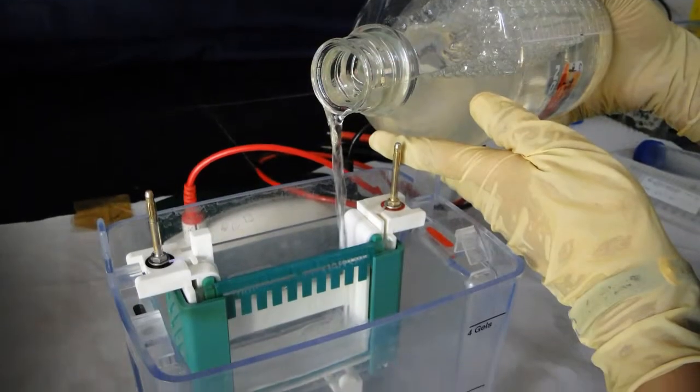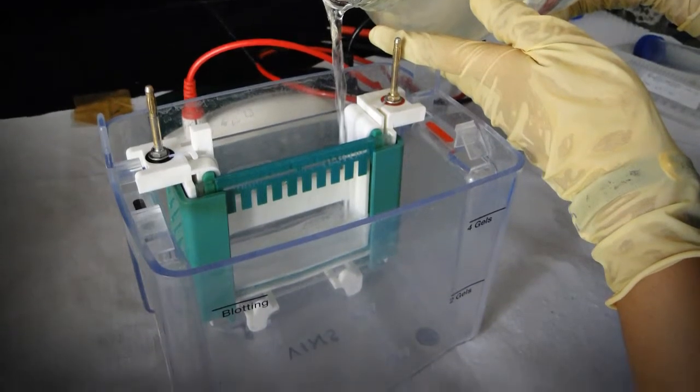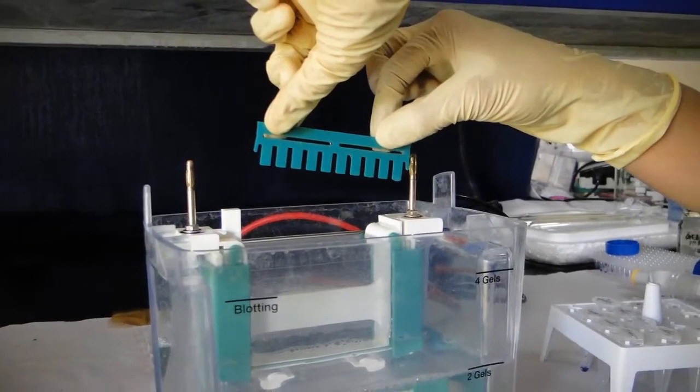Fill the inner chamber of the tank with 1x SDS running buffer of pH 8.3. Remove the comb carefully without breaking the well. Now the gel is ready to load the samples.